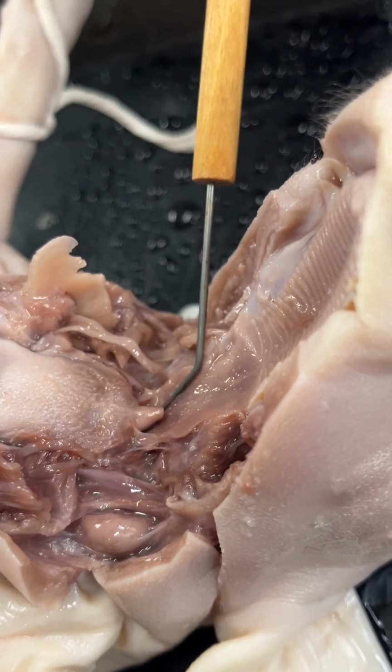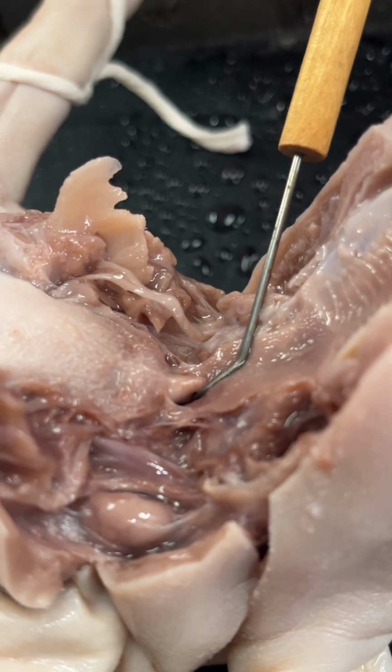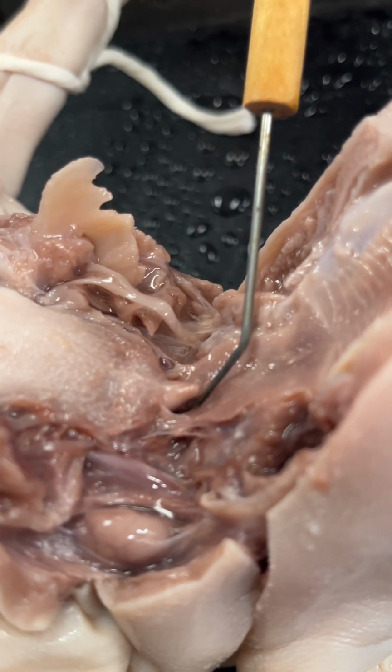This is the pharynx. This is the name for the empty space posterior to the nasal cavities and soft palate. This can be seen by the hole nearest the epiglottis. This is where the digestive and respiratory systems meet.